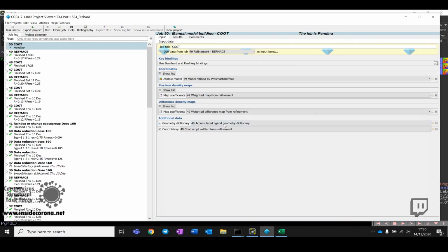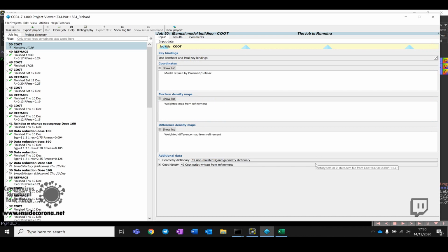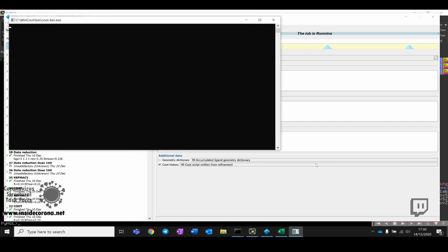Okay, so I'm going to click Coot, tell it to run, and it should appear soon. Okay, we've got Coot.